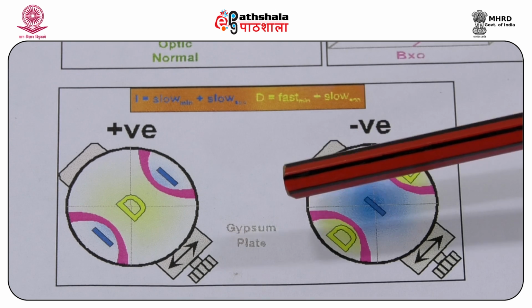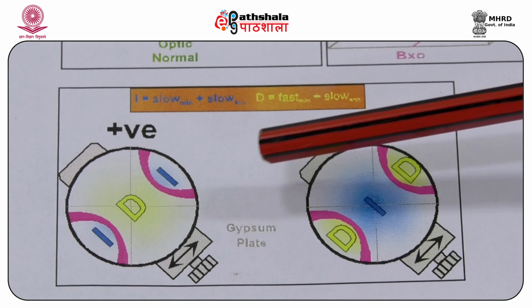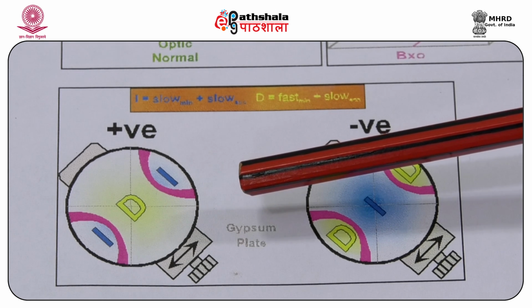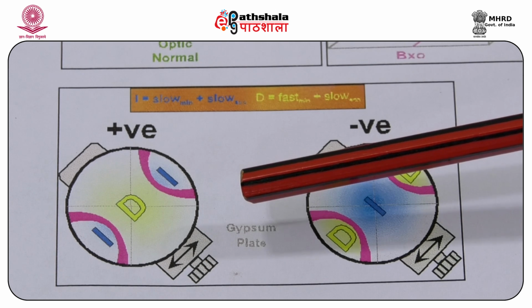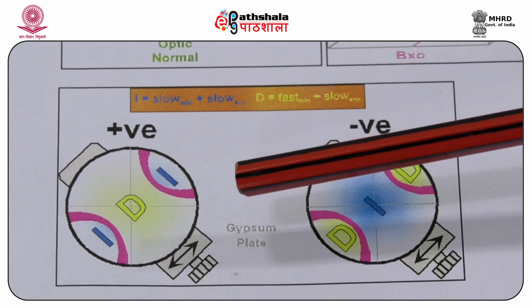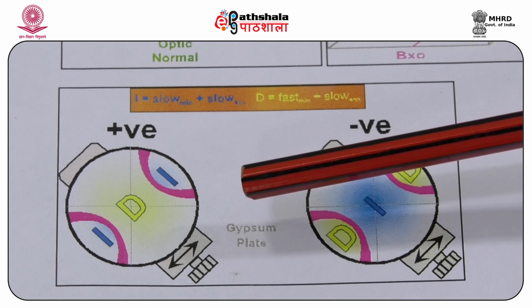This color change tells us that the ray which is vibrating parallel to the optic plane has a low index of refraction and must correspond to the n alpha, that is, the retardation of the alpha ray as measured along the x indicatrix axis. Therefore, the z indicatrix axis must be the acute bisectrix.